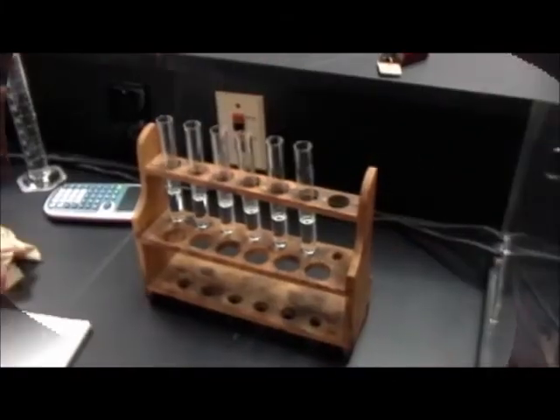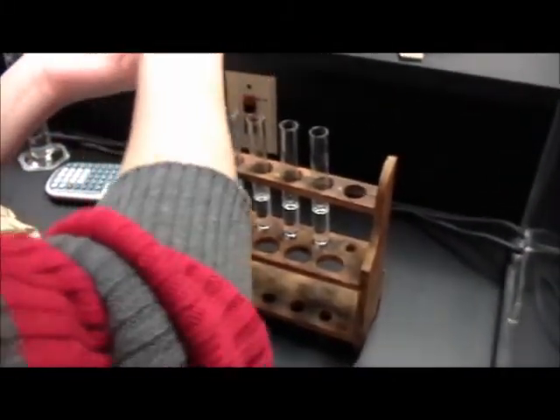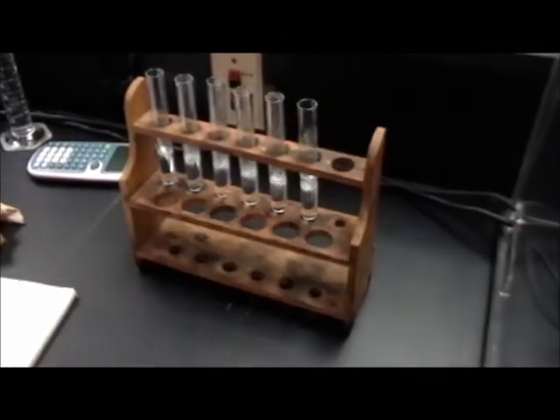So for each team of two, one person should be putting the magnesium strips into the test tubes rapidly, while the other person starts the stop clock and starts recording the time it takes for each chemical reaction to finish. Remember, the chemical reaction isn't finished until that fizzing of the hydrogen gas being produced stops.